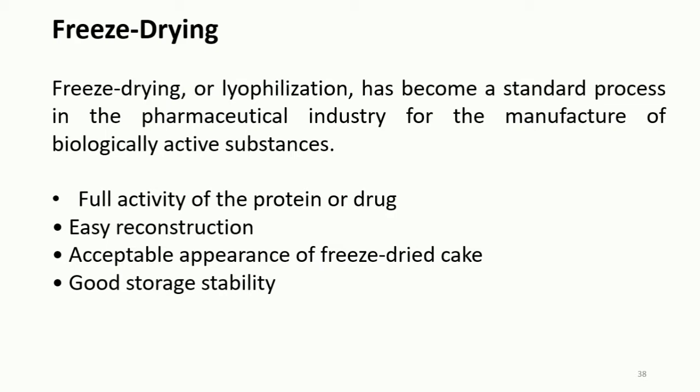All of these parameters must be optimized in order to achieve a final product with the desirable characteristics of full activity of the protein or drug, easy reconstitution, acceptable appearance of freeze dried cake, and good storage stability.